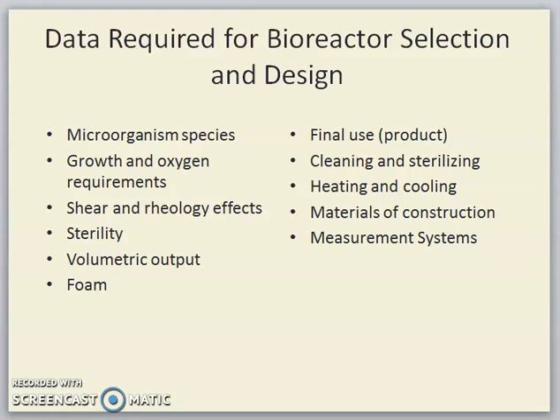And the sterility, which is very important in the bioprocess or biofermentation. On the hygiene, we need to know the procedure for how to sterilize, by using steam blasting, or in the lab, we use an autoclave.